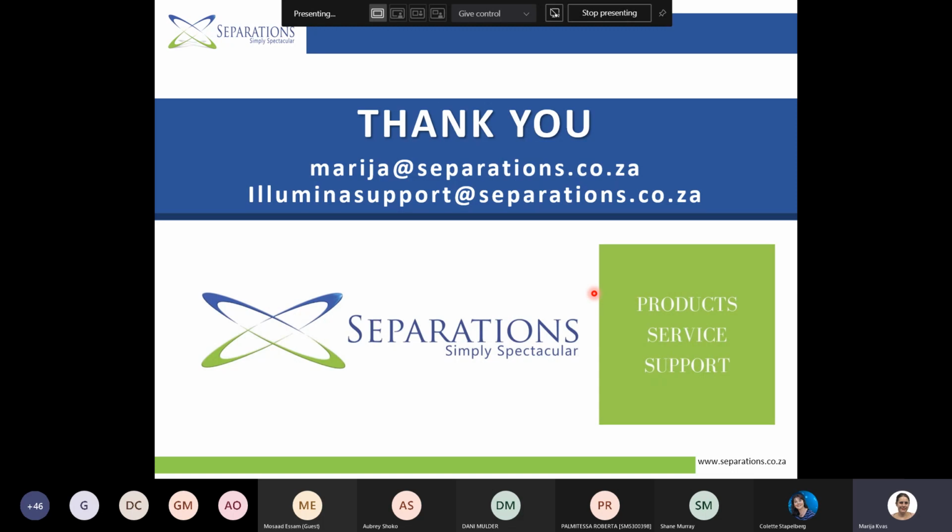Like Colette mentioned, we will go a little bit more into bioinformatics, and we will touch on specific pipelines that we can utilize when it comes to DNA applications or also RNA applications as well.